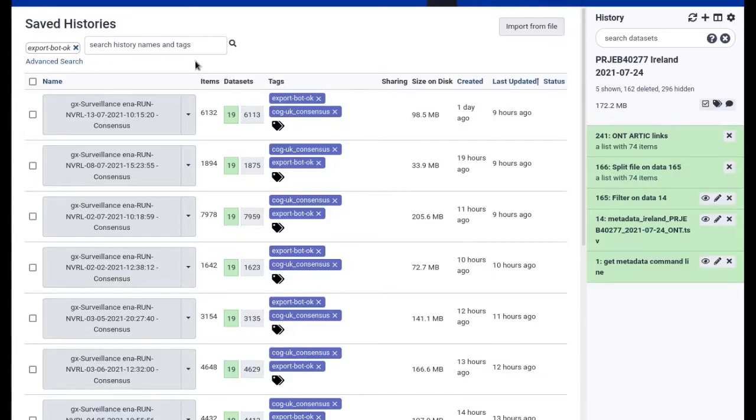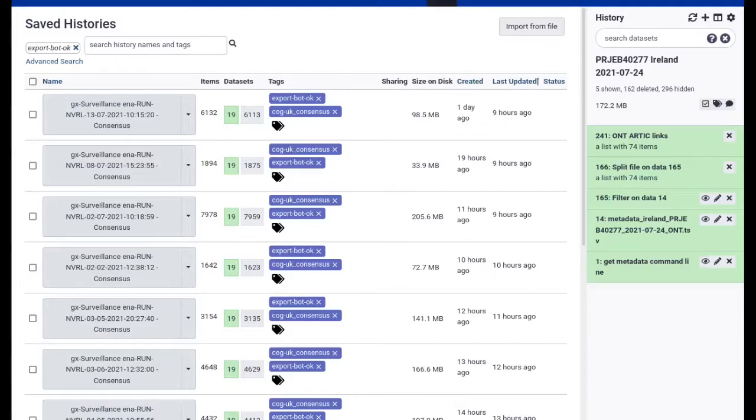This bot may now produce many similar histories, one for each batch of sequencing data it analyzes. Here's an example of the situation on usegalaxy.eu which demonstrates the issue for consensus building histories. Each of these histories contains one collection of viral FASTA sequences, but how can we get at them conveniently?